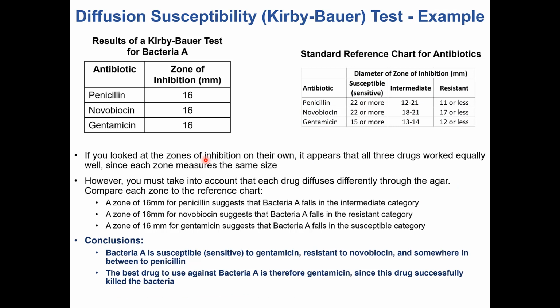So this last slide here is an example experiment. The table on the left is giving you results of a Kirby Bauer test that was performed on bacteria A. It doesn't matter what the bacteria is.